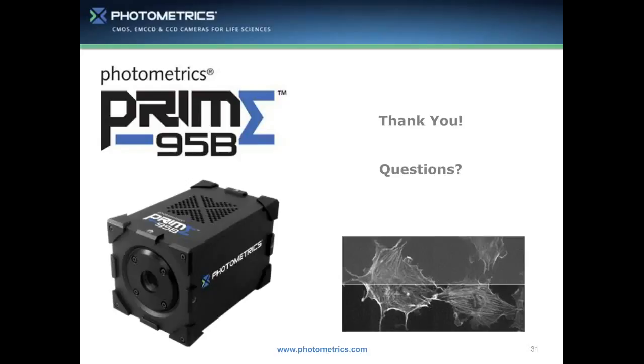Are you suggesting that we switch our EMCCD out for a BSI CMOS? Is it worth making the change? I think for the most part, as you move forward, the back-illuminated CMOS becomes a more versatile option, but it doesn't mean that EMCCDs are now defunct. They still offer great levels of sensitivity and great frame rates. Just as technology develops, you're able to add more functionality and better performance as technology progresses, and that's what the back-illuminated CMOS represents.